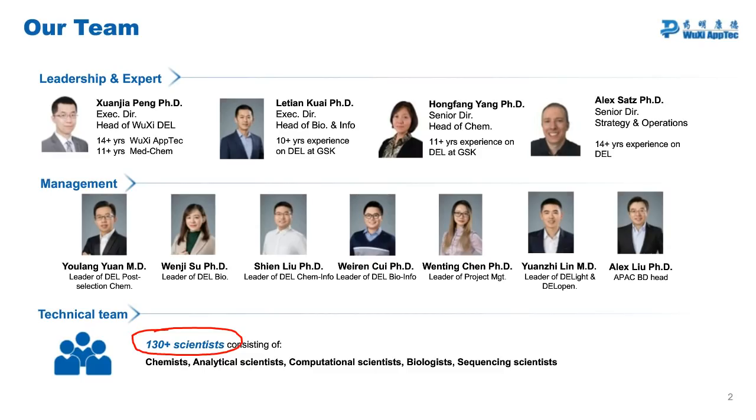This question reads, whether the binding is at allosteric or orthosteric, is there any mechanism to understand the same? So yes, if you have a positive control that you know binds to the orthosteric site, then you can spike that into one of the screening conditions in a large amount. You can displace any binders to the orthosteric site, and that will let you know which library members are therefore binding to that orthosteric site. Proving that something is binding to an allosteric site can be done in a straightforward manner as well, but only if you have a control which you know binds to that allosteric site.